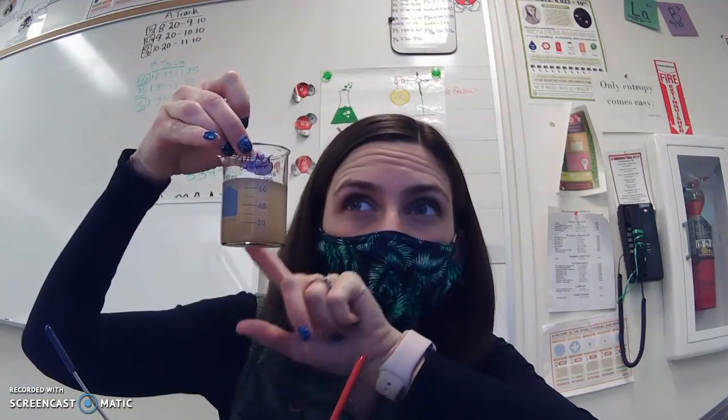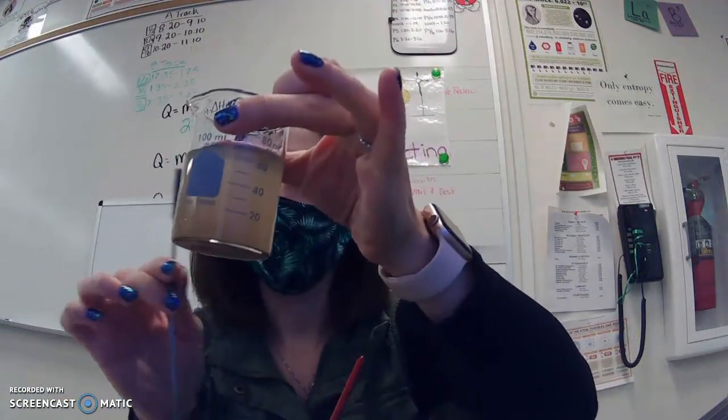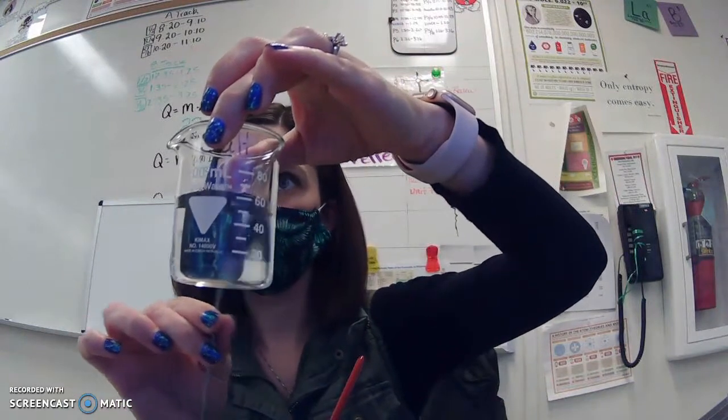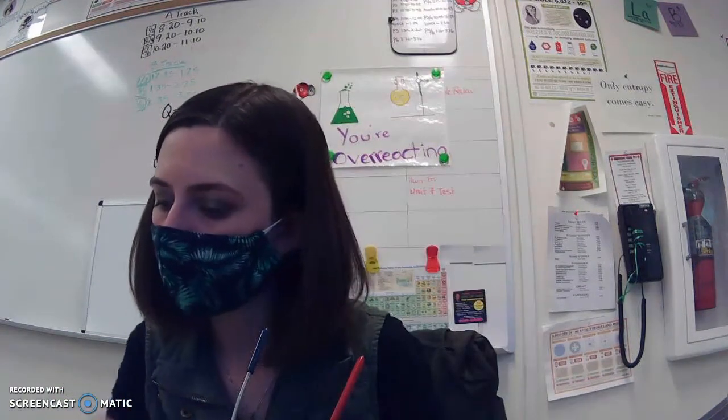So here, is it a clear substance, or are these things floating? And let's see, there's little chunks that are floating by. They're a dark brown color. So this one has a medium turbidity. You can still see through it some, but not much. If I were to hold up this dark blue behind it, you can't really see it. Versus if I were to hold it up behind this one, we can see it. So that one is turbid.